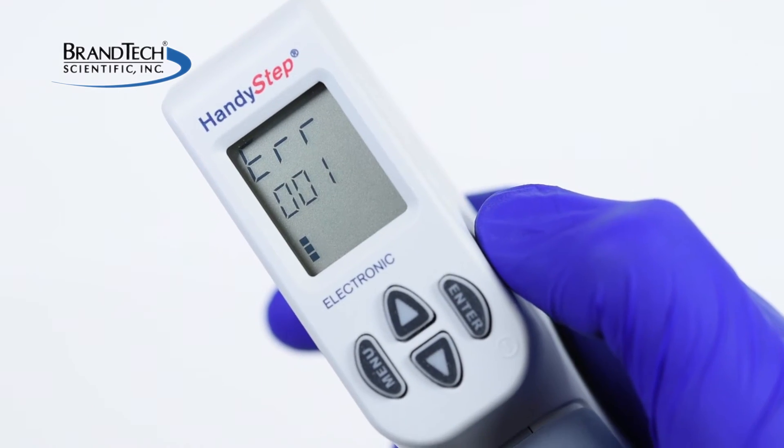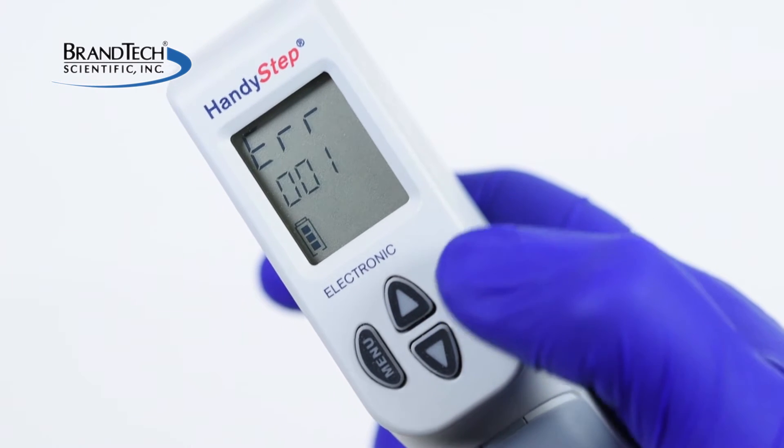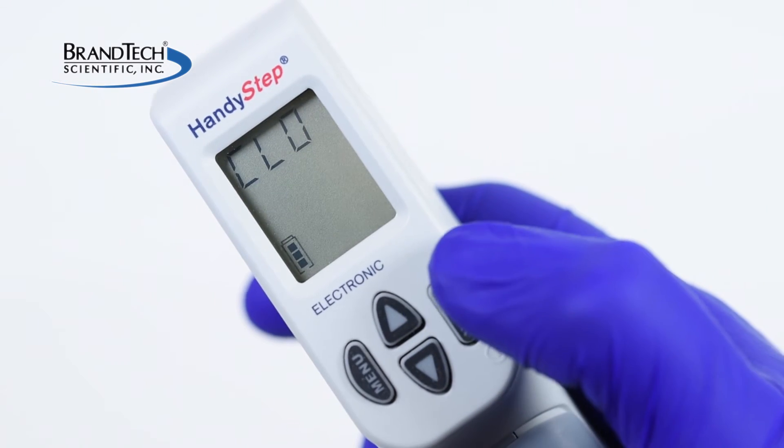Anytime an error is shown on the screen of your HandyStep electronic, push the Enter key and a screen will assist you in clearing the error.